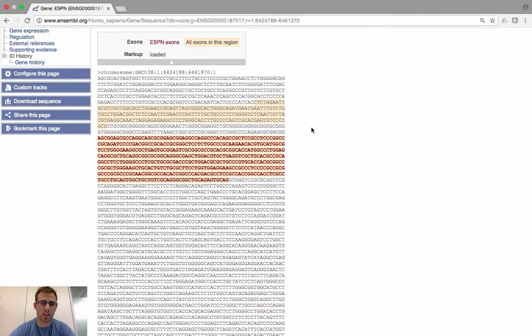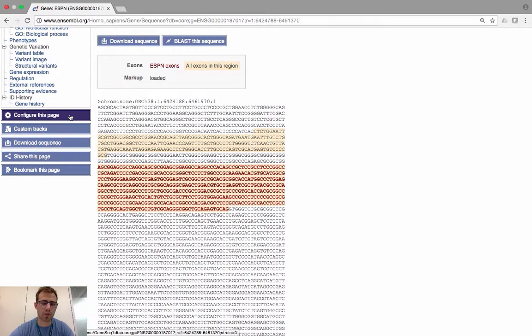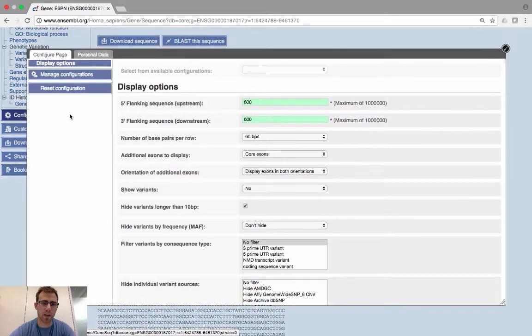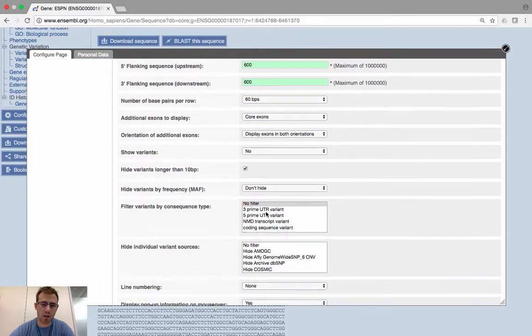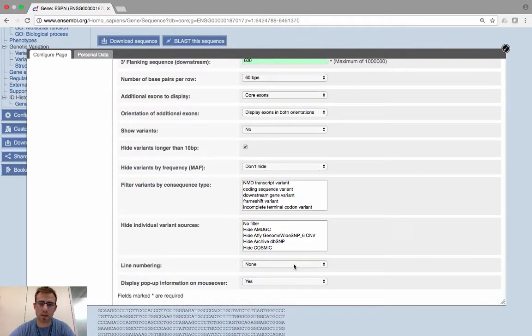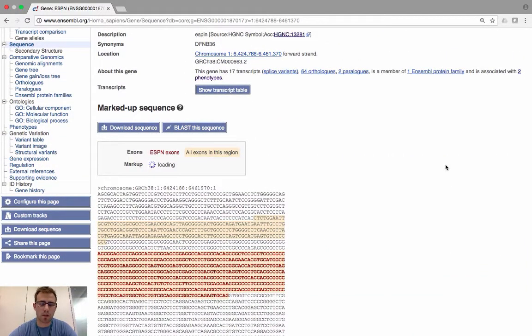You can also configure this page to view different types of sequences and annotations. If you click on Configure this page, you'll see a number of ways to adjust the sequence view — you can choose to extend the upstream and downstream flanking sequence, view variants, or add line numbering to your sequence. This is the full genomic sequence with all exons of all ESPN transcripts annotated, but if you're interested in a specific transcript, you'll want to view just that transcript's exon and intron sequences, which is what we'll do now.